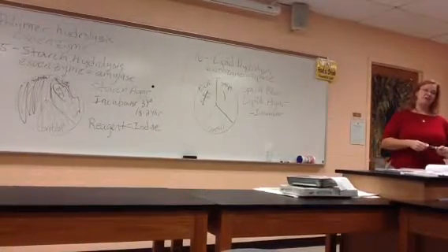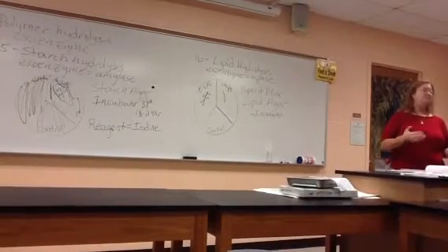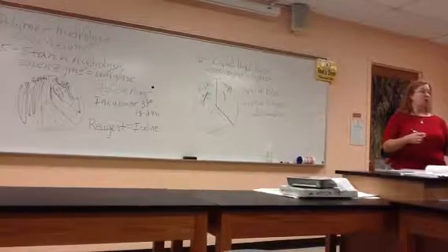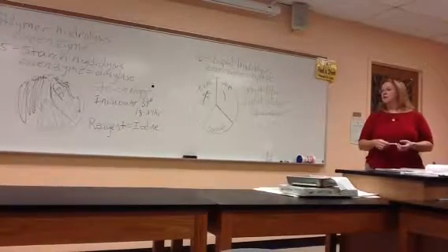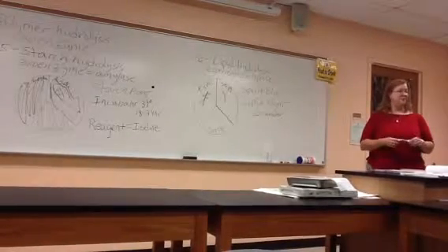And the negative bacteria, what do they look like? Same. They stay the same. Probably better to say no intense blue color, because again, that way I know that you know what positive would have been. Right? So no intense blue color for negative. And that means they don't make lipase.